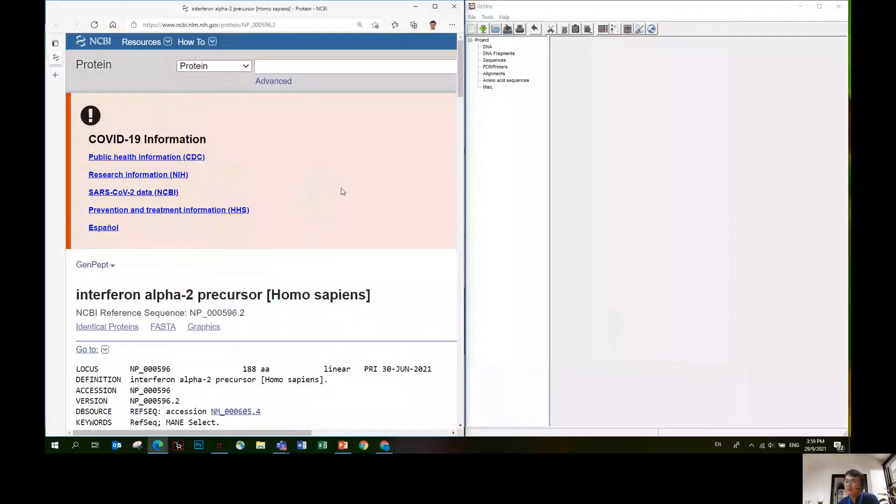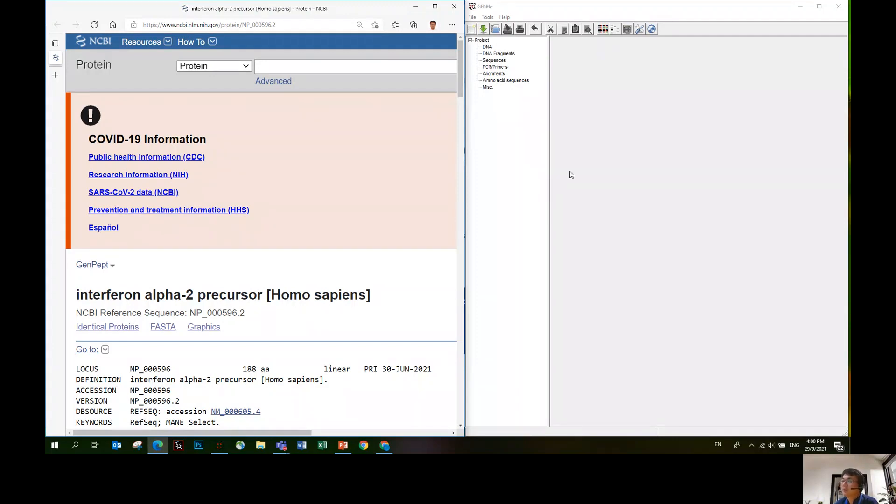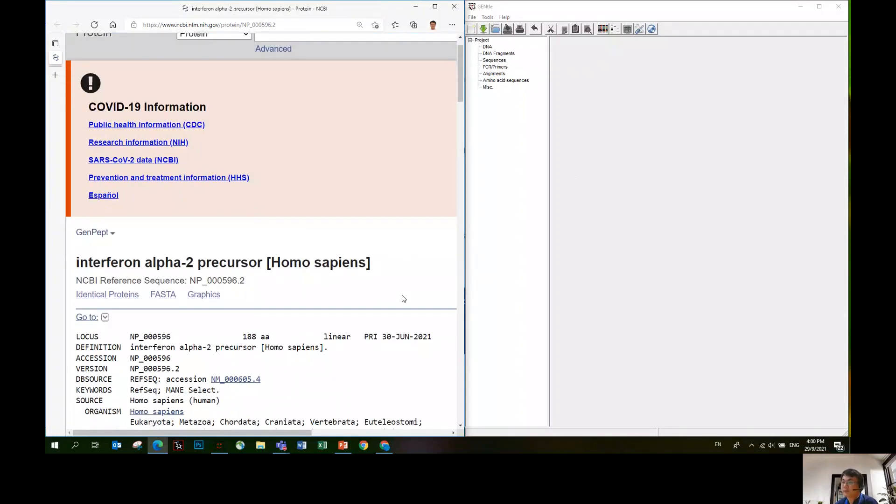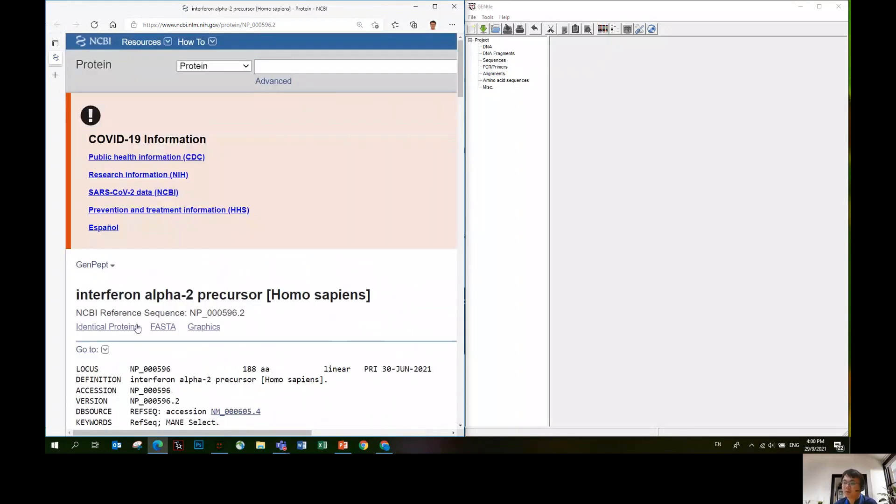Today I'm going to give you a quick demonstration on how to use Gento to create a protein entry. In the previous semester we have used Gento quite often but the application was mostly focused on DNA. We can also create protein entries and the process is very similar, so I'm going to do a quick demonstration.